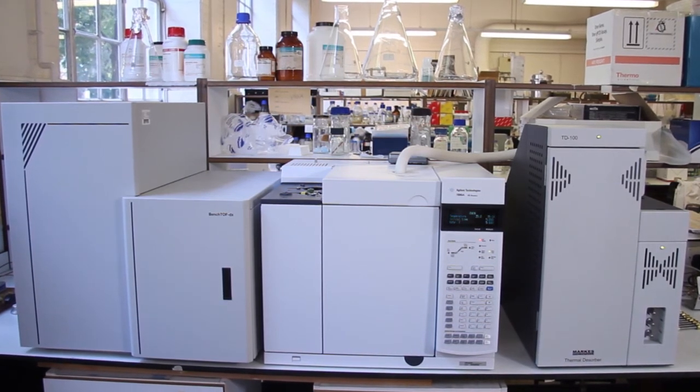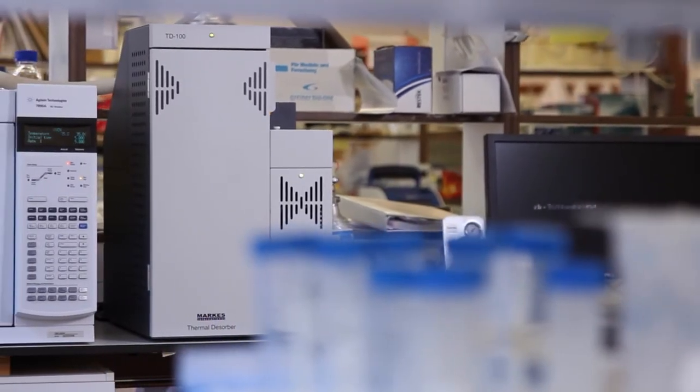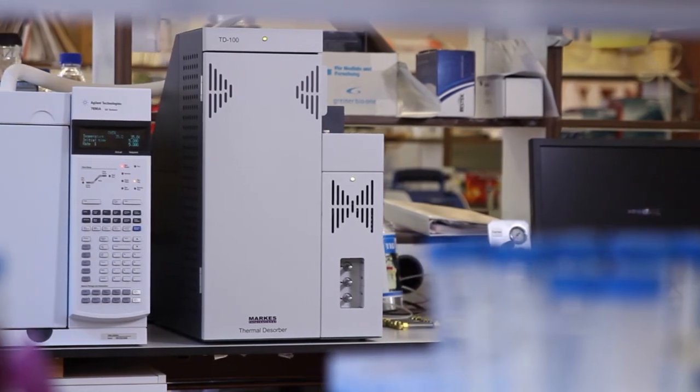The collaboration has brought my research capacity really up to the next level. Sensitivity and range and mobility of the sampling allows me to undertake projects now that haven't simply been possible before this collaboration started.